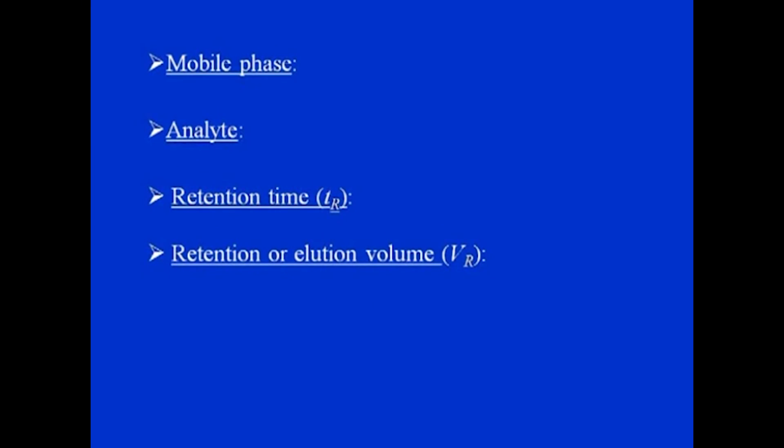In the next lecture, we are going to discuss certain terms which define the performance of chromatography systems, for example, retention time, retention volume, capacity factors, resolution, and all different kinds of terms.